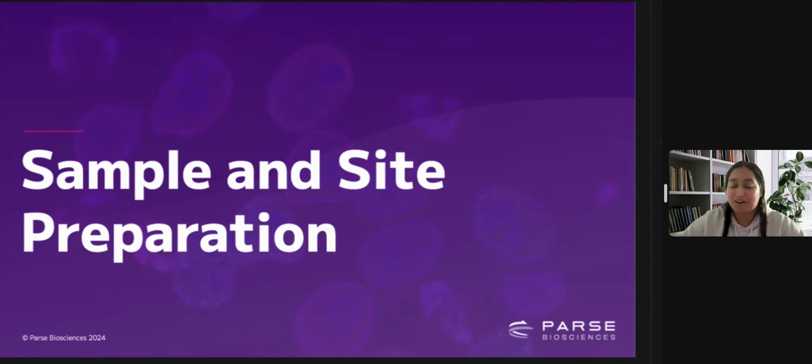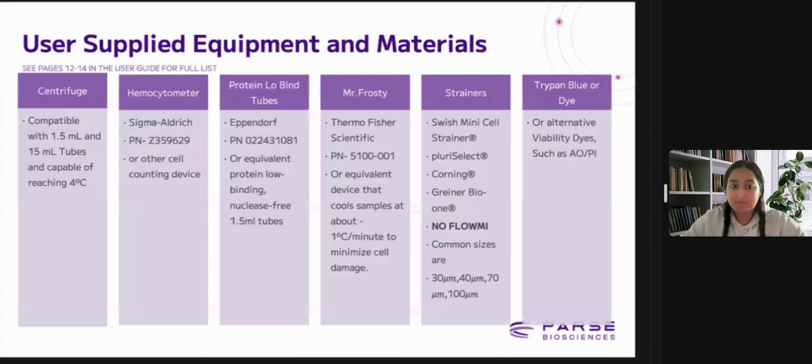We're going to fix them, we're going to barcode them, and we're going to ensure we don't lyse anything until the last barcode. After the 3rd round of barcoding is when we actually lyse. So there's no lysis that occurs until way at the end. That's why that fixation process, that sample prep, is so critical.